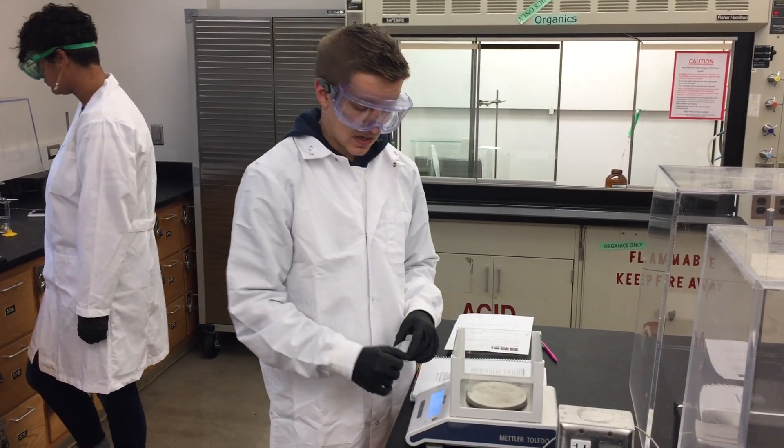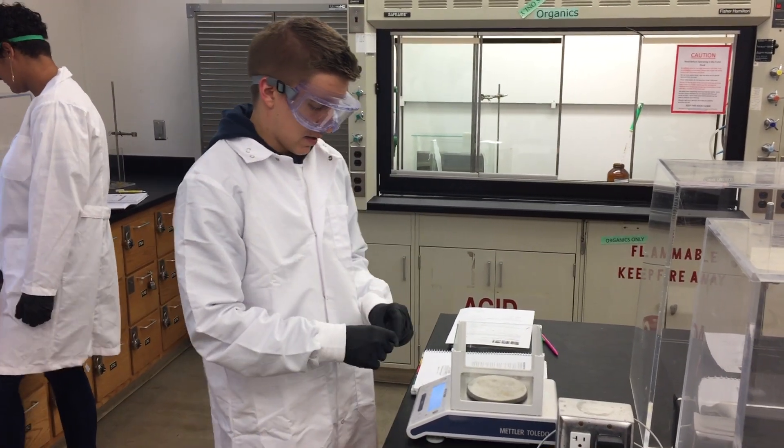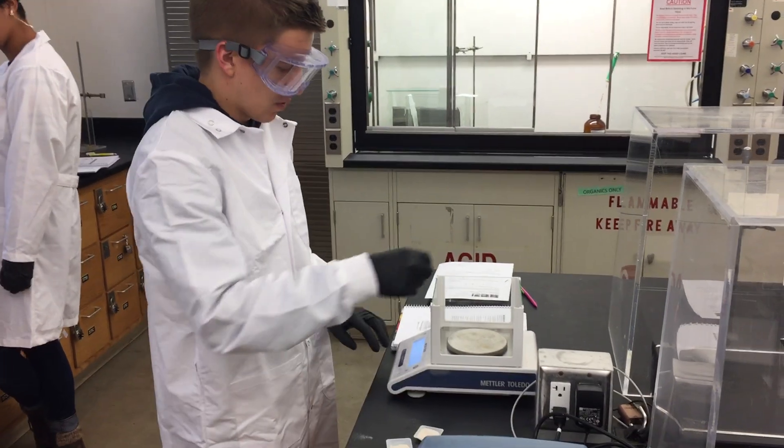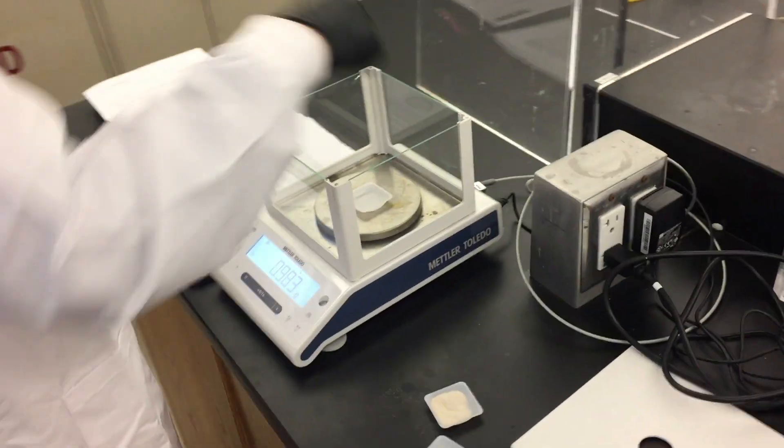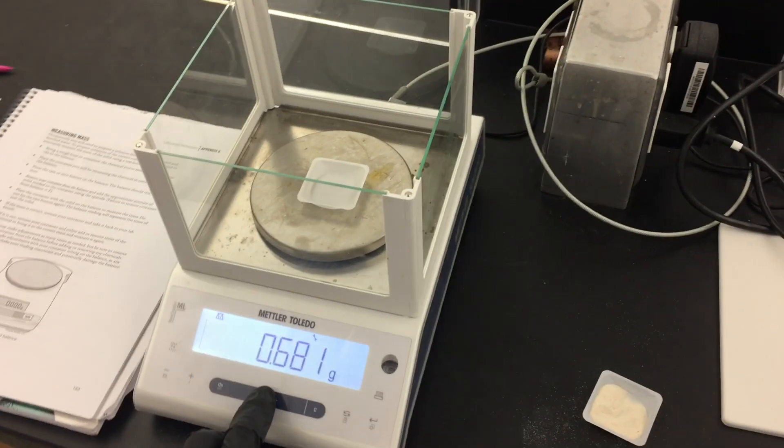When we start, we want to make sure it's at zero. Then we have a weigh boat, and we will place the weigh boat on the scale in the center. After we get the reading, we will zero it out.